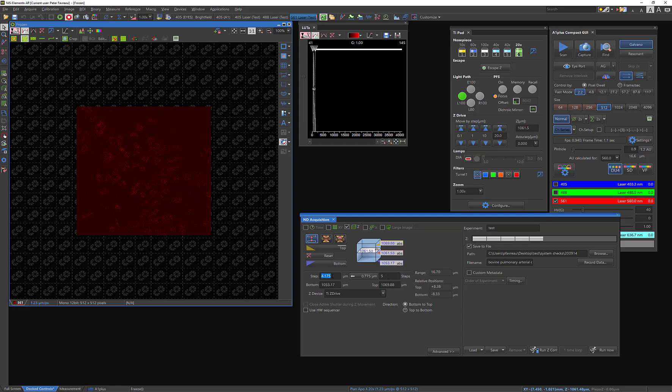So this is going to be up to you in the end. Some people have in mind exactly the number of steps, therefore the number of images they want to acquire. Some people are less strict on that. So in the end, it'll be up to you to decide exactly the size of your volume. And that's going to depend on the amount of time you want to take in your experiment and so on.